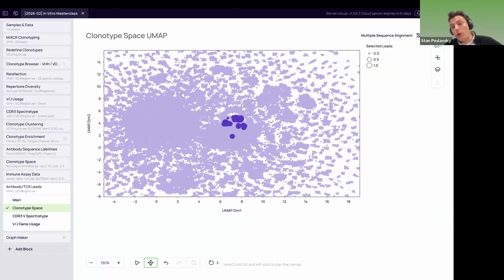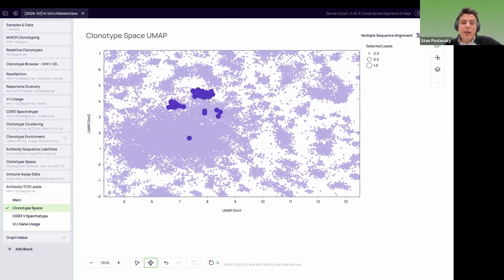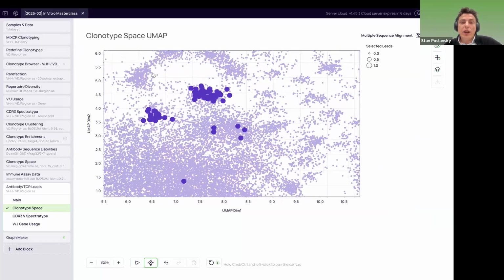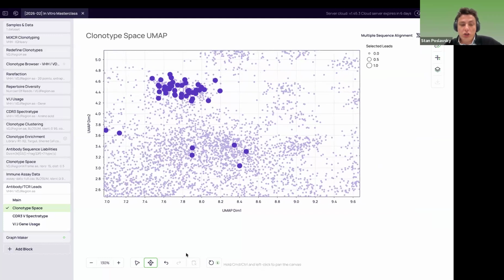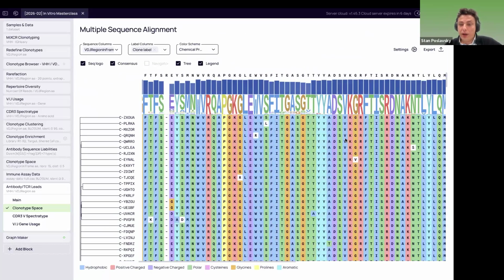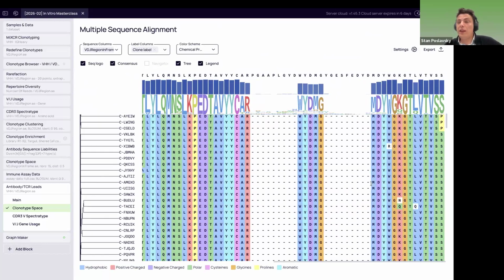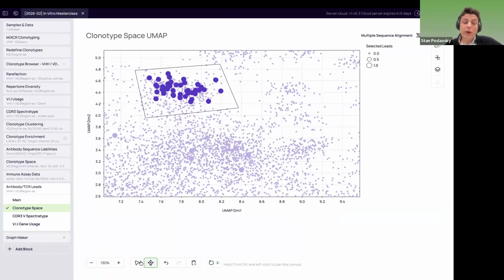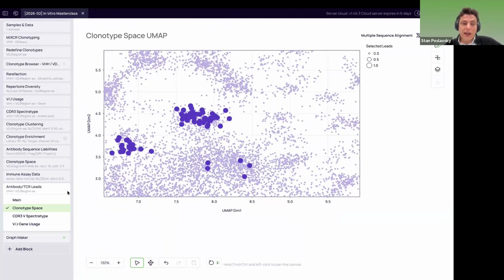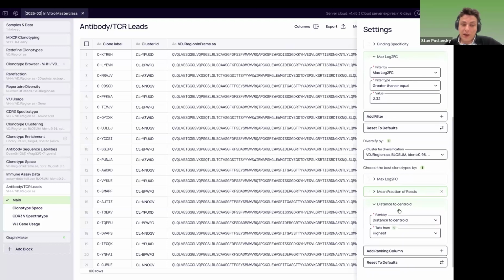And what we want to avoid, and that's the next step of our iteration, is that we have pretty many candidates located in this specific cluster, which will not have sufficient diversity. If we pick them here with a multiple sequence alignment and compare, that's not enough diversity in the candidates we're picking, and that's what we want to avoid further, which we again can do. But I don't want to use up all of the time on different prioritizations and runs here.